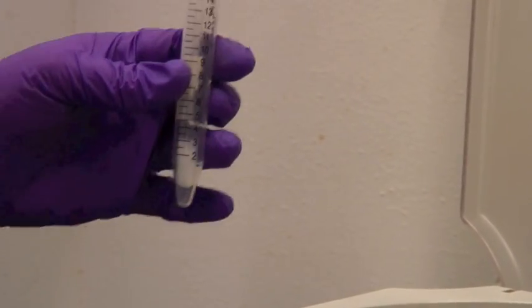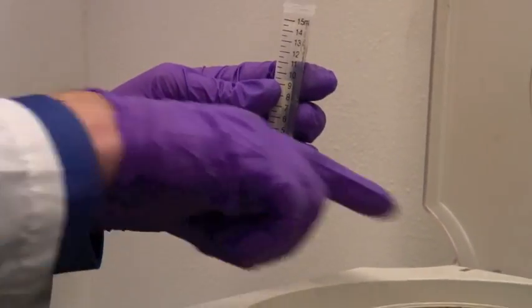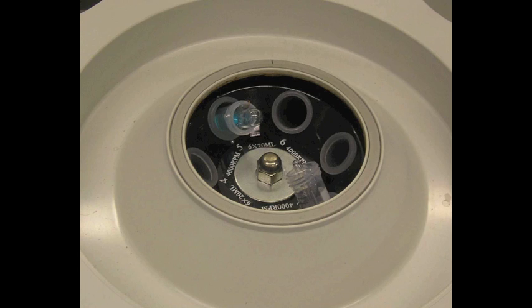Now, a centrifuge has six slots in it, and they're numbered one through six. Try and remember which one is yours because they all look the same. You will get confused.